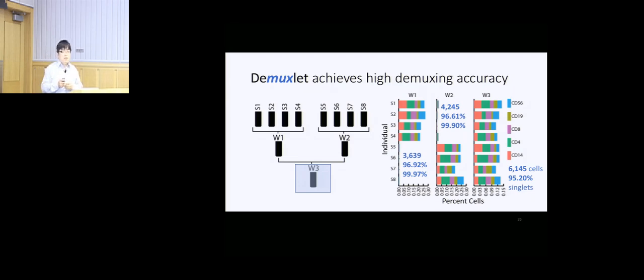Yeah, so that's an excellent question too. You're definitely right. You can look at the doublets and try to understand what kind of mixture of cell types are in them. You need to know the cell type of both of the contributing cells, and you can also use the read information to deconvolute which reads are coming from which cell. So I think that's an interesting area.